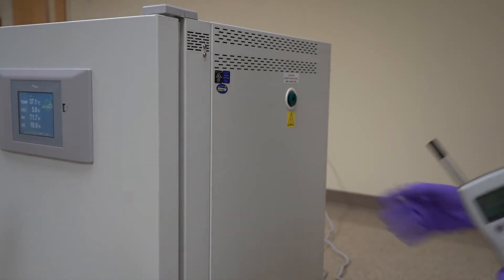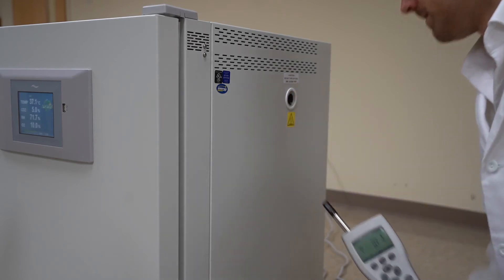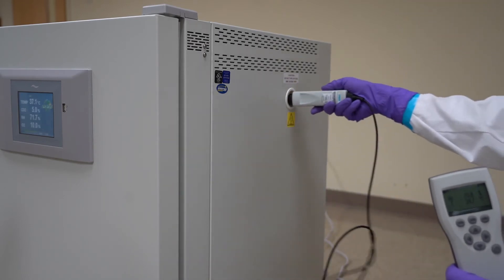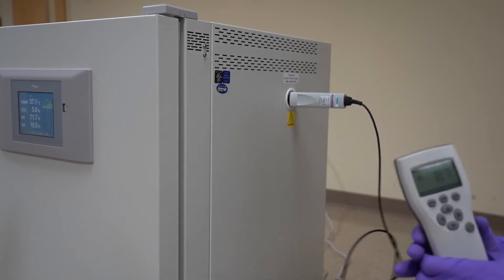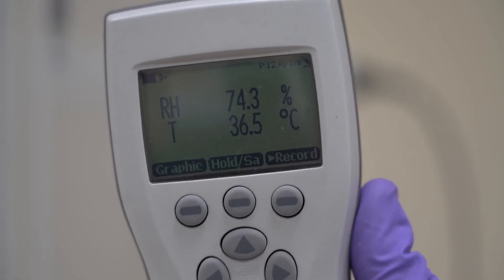Insert the hygrometer through the side port and into the chamber. Follow the hygrometer's instructions to take a stable relative humidity reading.